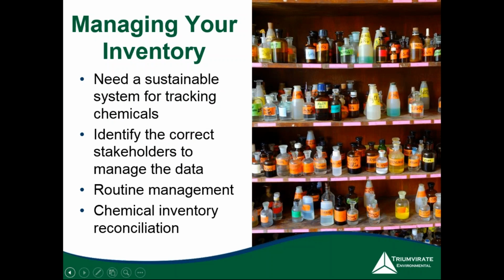So I want to get into managing your inventory now. You're going to need a sustainable system for tracking chemicals in, out, and throughout your facility. And you're going to have to identify the correct stakeholders to manage that data and keep up with the routine management of the program. And that's done through things like a chemical inventory reconciliation.